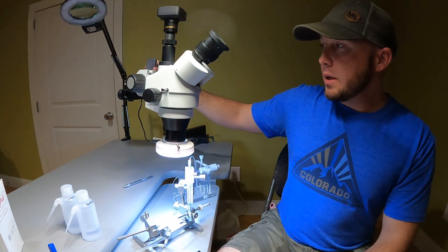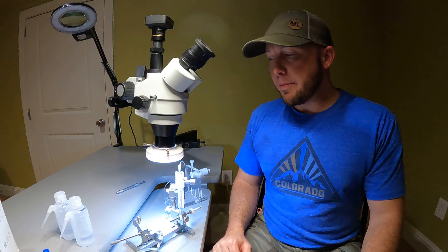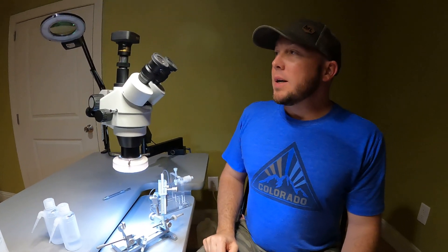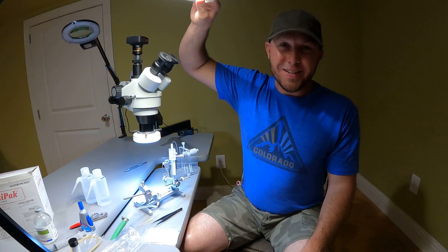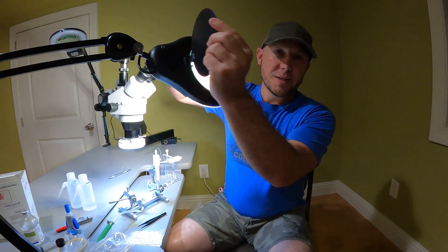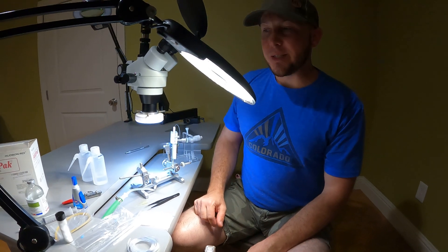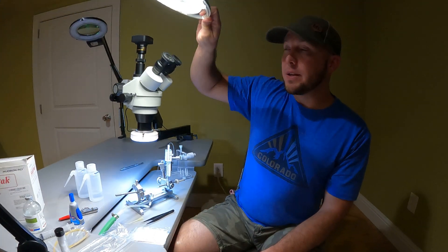My scope — it's just a cheap AM scope, nothing fancy. Stereo zoom. You don't need extreme magnification to collect semen or inseminate queens. Something like this with an articulating arm works really well. The last piece is supplemental lighting. You'll find doing this type of work you really want the space to be well lit. You can flip it up to magnify, so if you're putting a disc on a queen or assembling all your parts and pieces, this lights the way and the magnification is definitely appreciated.